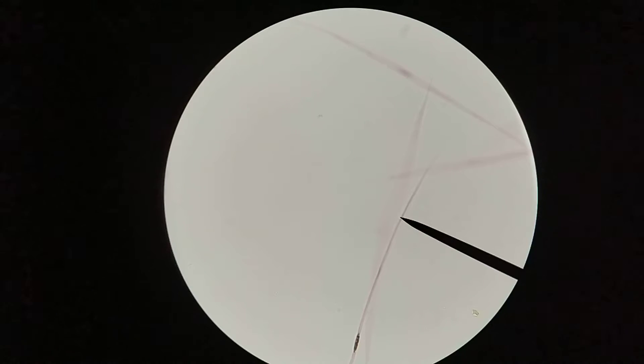This is simply because these are very long cells and the nucleus is just a small structure in the middle of a very long cell. So it's very rare to get a cross section through a nucleus. In many cases when looking at a cross section through smooth muscle, all you will see is a whole bunch of pink eosinophilic discs, and only occasionally a nucleus — a lot of empty-looking cells. To show you this, I'm going to switch to another slide that gives you a view of both the longitudinal and cross section through actual smooth muscle in actual tissue.